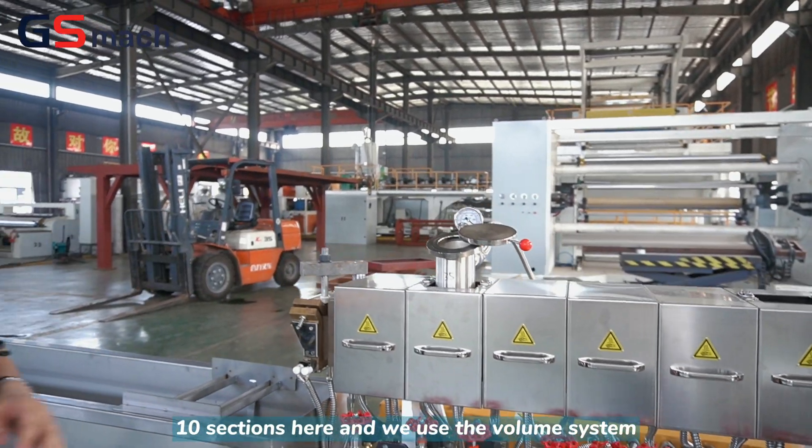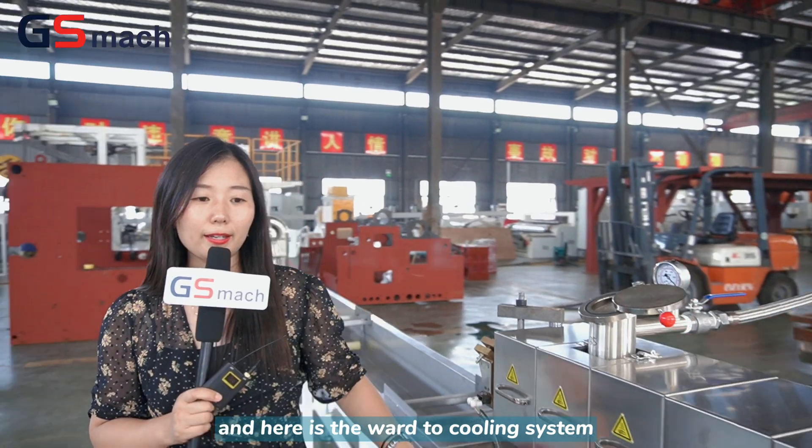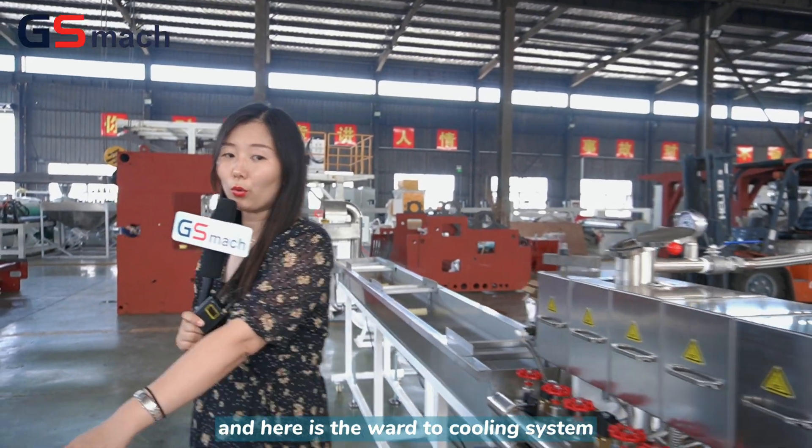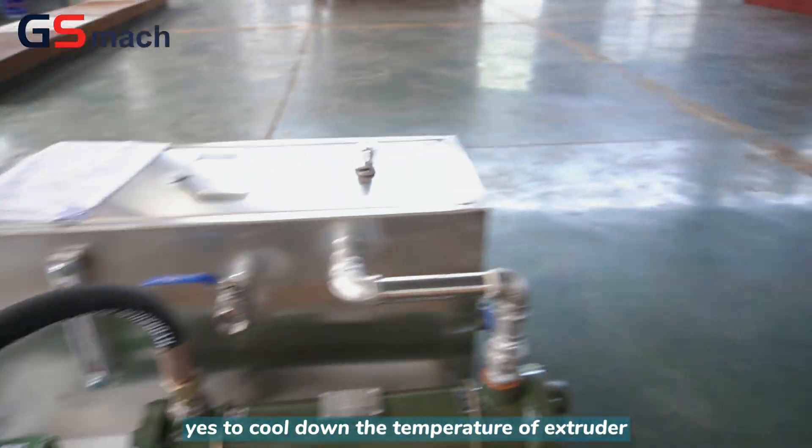There are 10 sections here, and we use a vacuum system. Here is the water cooling system to cool down the temperature of the extruder.